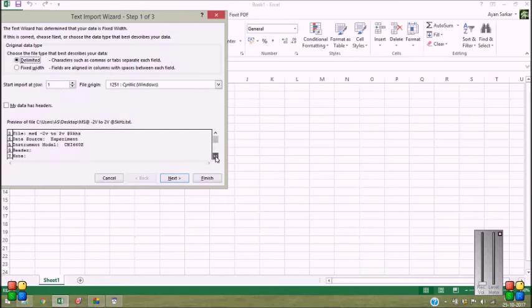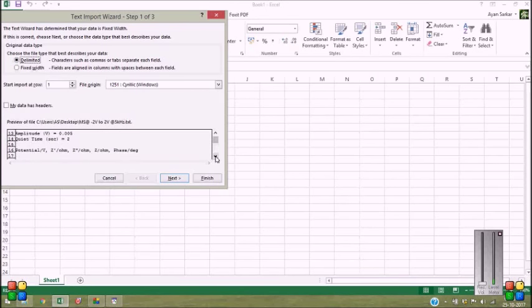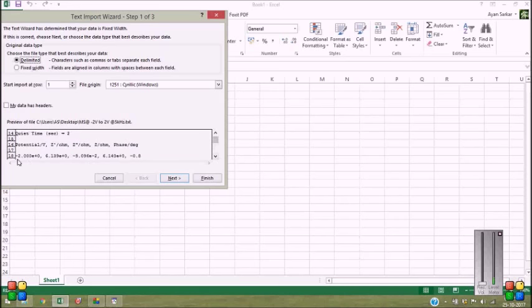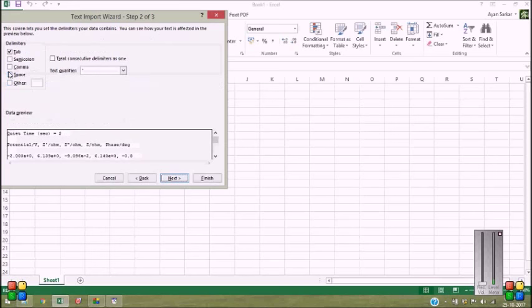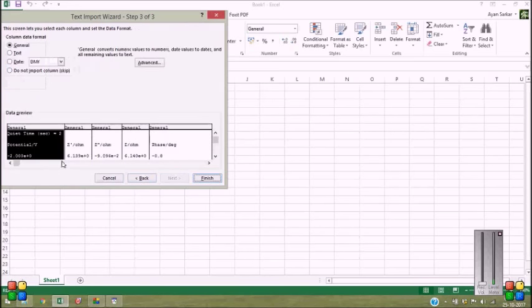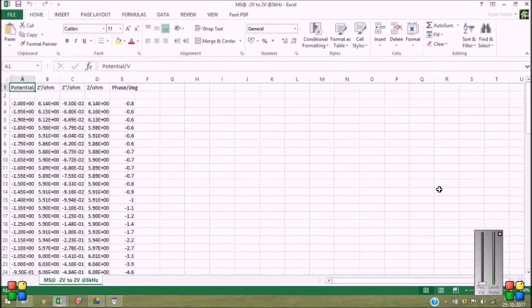And let's check where the data actually starts. It's from 16. However, you can choose 18 as well, but for my convenience, I am choosing 16. Next, comma, next, generally, okay, finish.